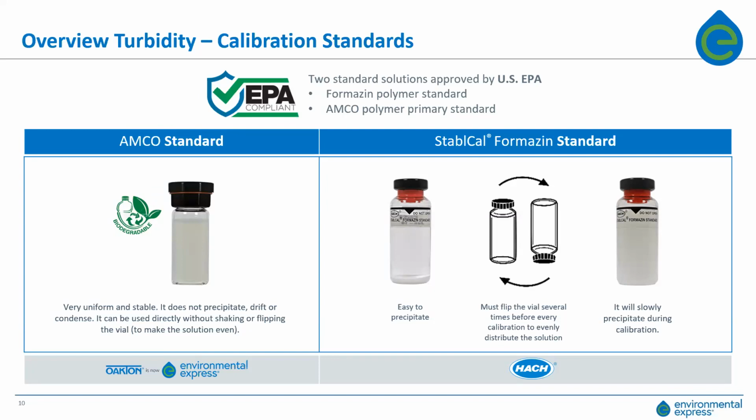I would still recommend taking the cuvette by the top, place your thumb at the bottom. You don't want to get any fingerprints on the optical path, but inverting any turbidity standard just to make sure that it is consistent and well mixed. It's homogeneous. Do not get fingerprints on that glass cuvette, as that'll definitely mess up your readings.